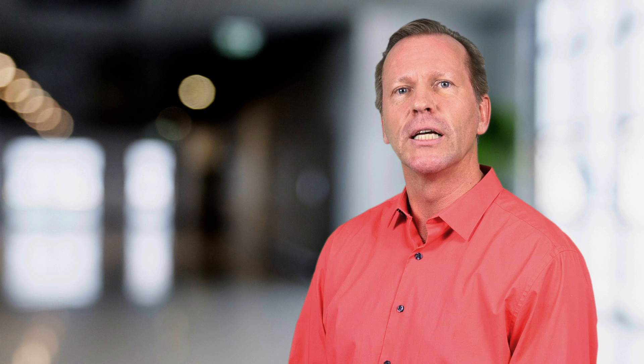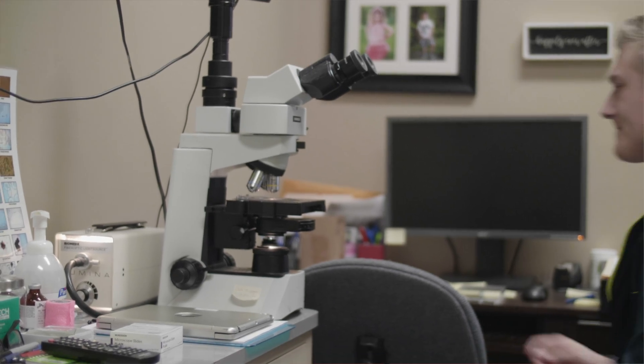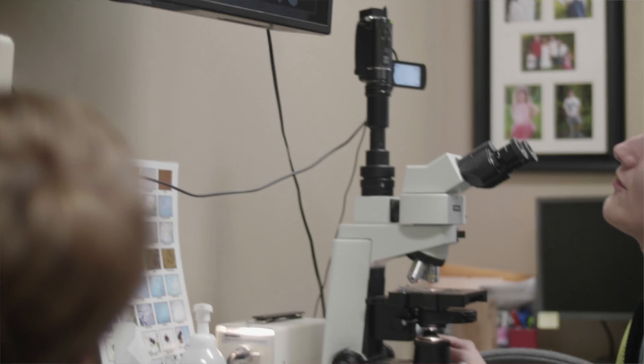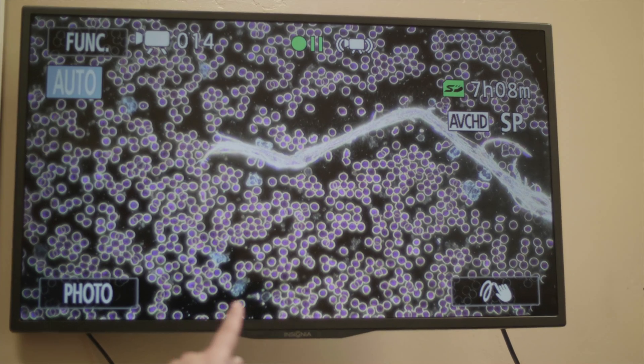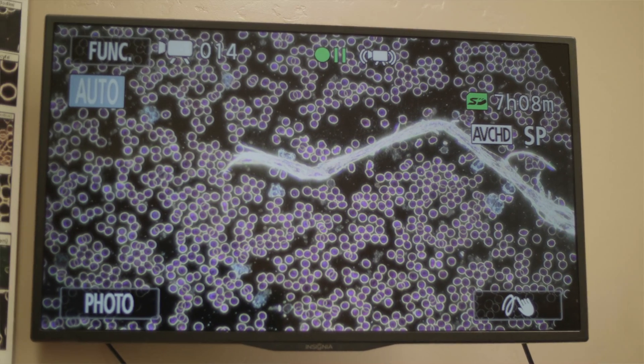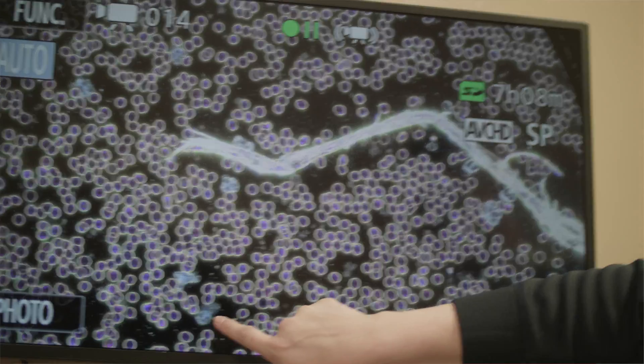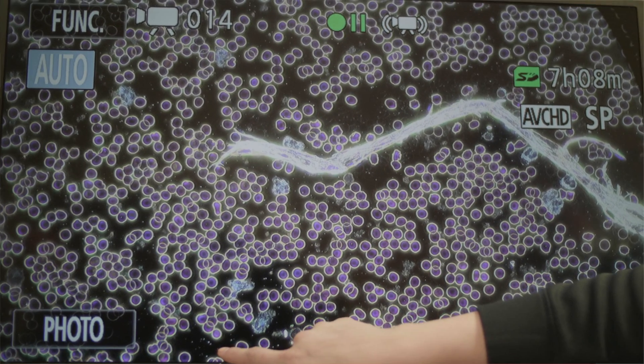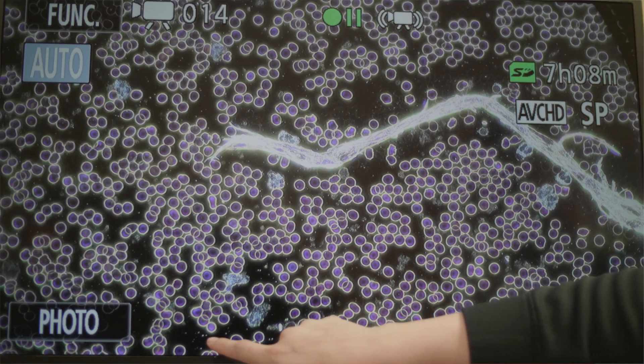Nutritional microscopy differs from traditional medical blood testing. It involves magnifying a single living drop of blood to 1,000 times or more under a microscope. The cells of the blood live for at least 20 minutes, and with the aid of a video camera, are observed on a monitor, revealing information related to the state of health of the individual.